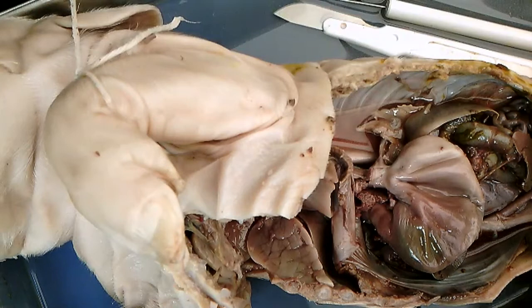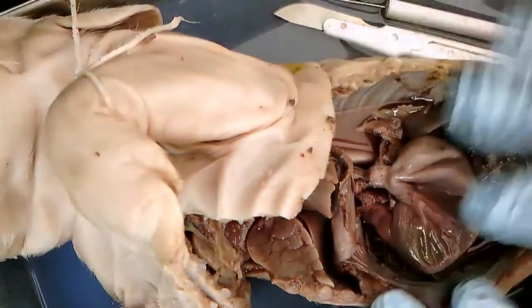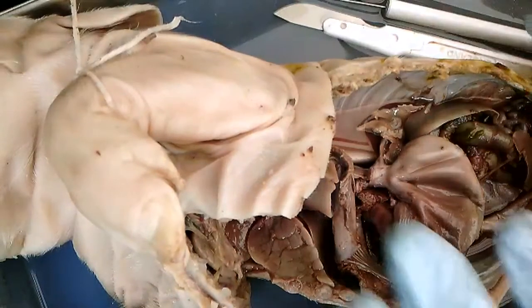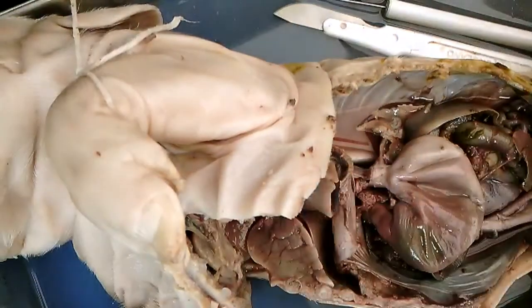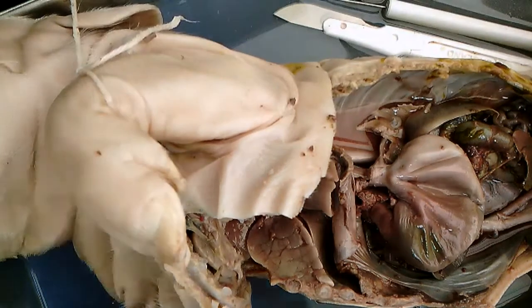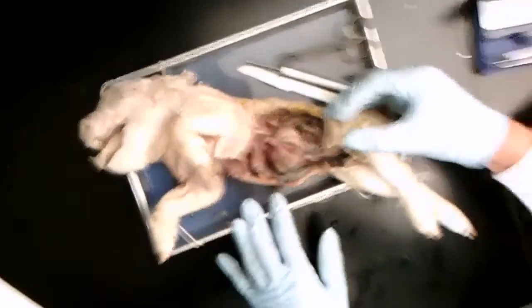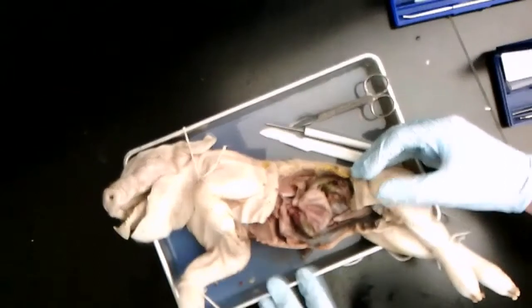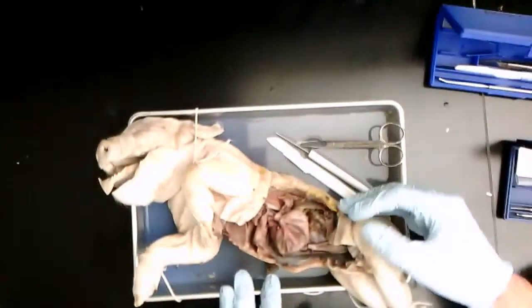For the purpose of today, we just showed you how you might make the dissection and where the organs are located. But it would be very beneficial for your students to go much deeper and develop different types of inquiry-based learning. Maybe it's some type of experiment that they could do while they're dissecting the pig to take it deeper, and they can make hypotheses, collect data, and draw conclusions from that data.